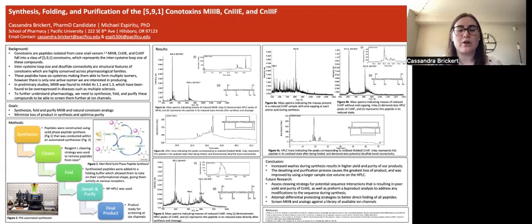This repeats over and over again for each amino acid. In the case of my peptides, there are 22 amino acids, so this occurs 22 times. For those that are curious, I added a photo of our automated synthesizer. It's down in figure 2.